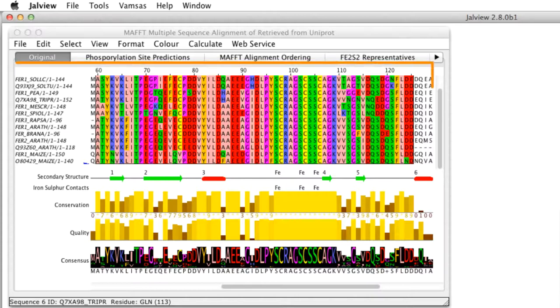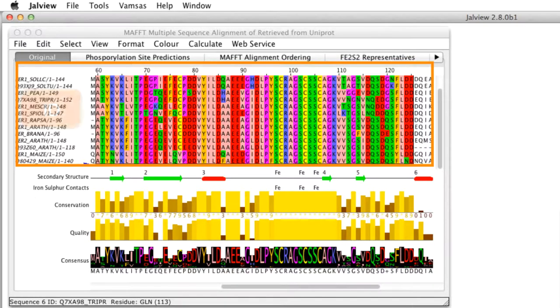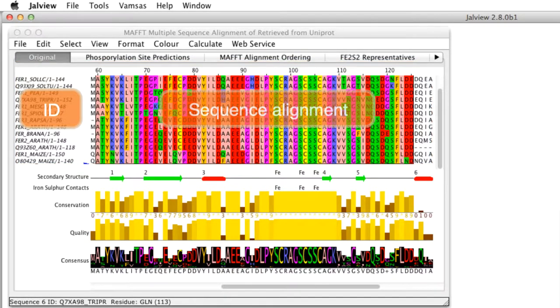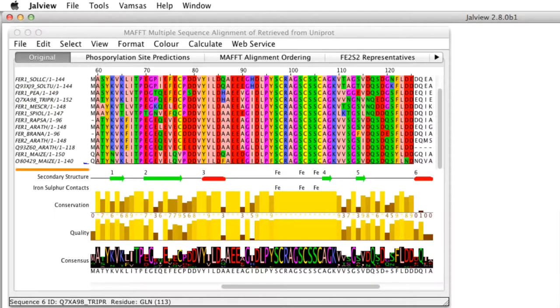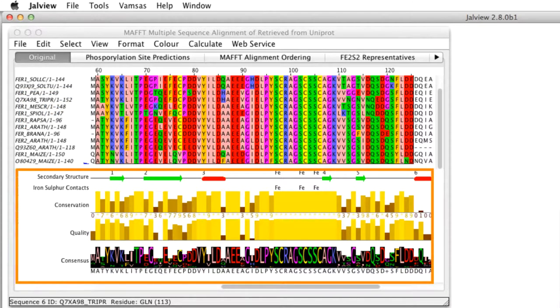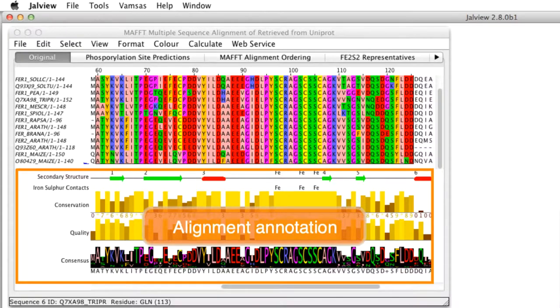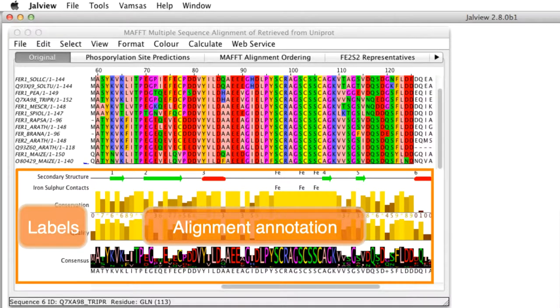Within the sequence alignment panel there is a sequence ID panel and a sequence alignment area. Below this there is an annotation panel with an annotation alignment area and an annotation label area.